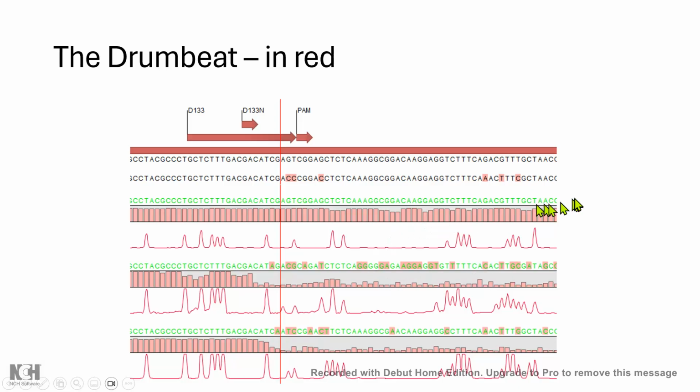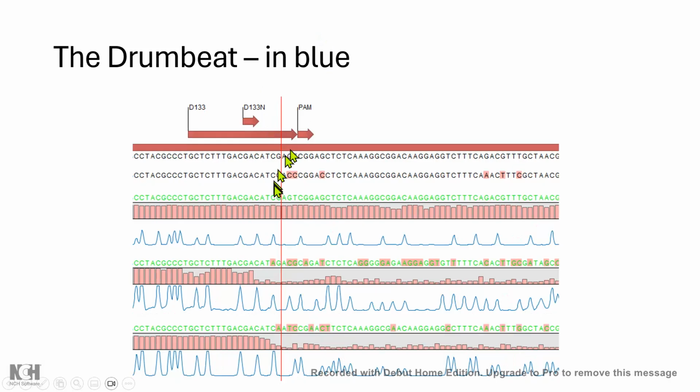I only chose an easy example because trust me, this is not the nastiest I've seen. This is the nicest. I've seen one where it was 16 bases lost, which did require a lot of deep thought and thinking about drums to solve. But also, if you have a hunch this is what the knockout is, then you can switch from drumbeat in red to drumbeat in blue. So yeah, because blue, or C, is more popular, you have every single isolated peak. Hey, loss of a single base becomes a doublet, while in this, because you have a two base gap, two distant guys become four distant guys.